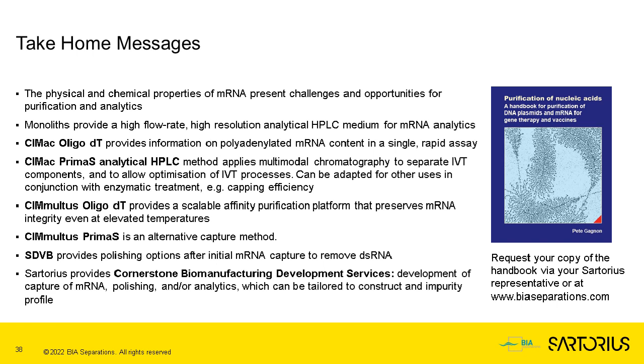That's a great question. I would certainly recommend monitoring the reaction batch to batch to ensure reproducibility. So depending on what are the currently monitored quality attributes, content is typically one of them, but the way the content is measured is sometimes questionable. Using this technology to monitor the kinetics of production really ensures reproducibility batch to batch.